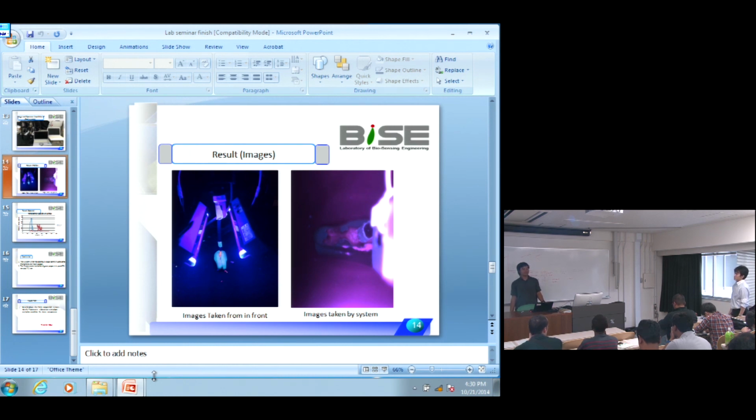Yeah. Last time I tried it, but I got a solution that is quite green, and also there were so many contaminants inside. The color became dark. Maybe oxidation was happening. Or maybe we need to make a good extraction to get a good solution. But once I got a good solution and exposed it to UV light, I could not get the fluorescent phenomena because, in my opinion, the concentration of fluorescence substances was very low. Then it cannot emit light.